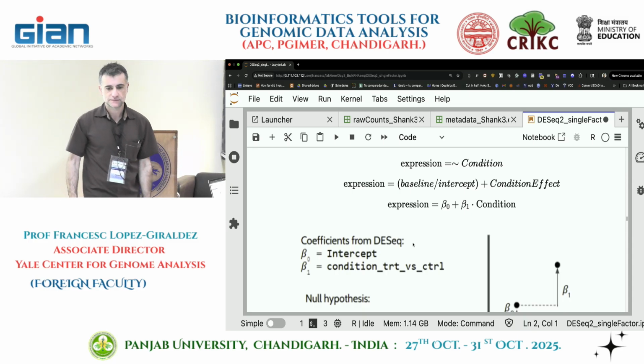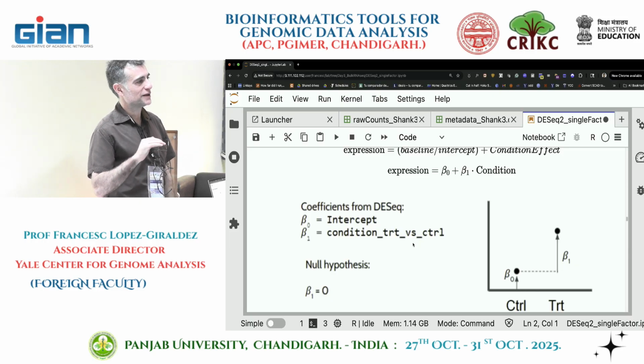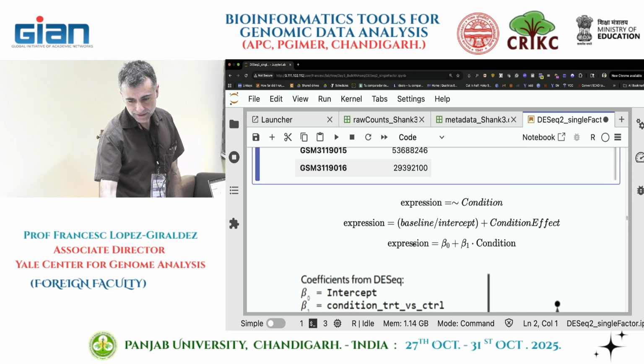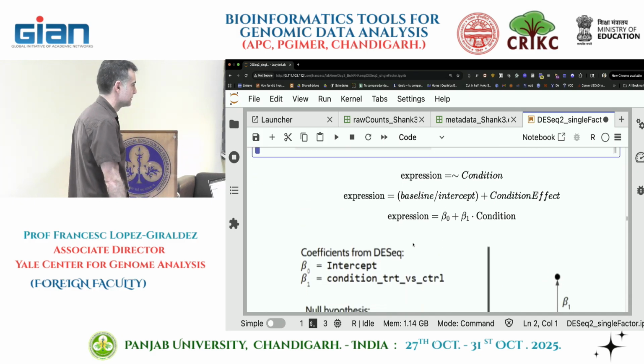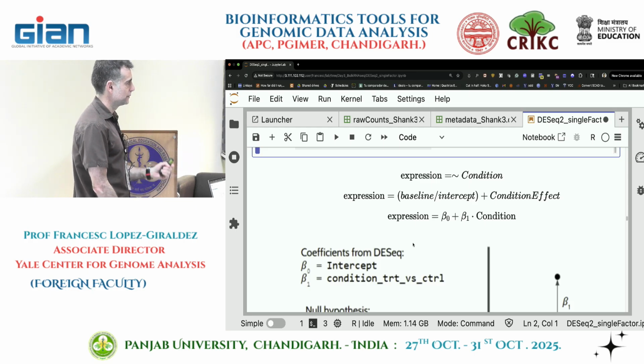It doesn't do anything else. Everything I'm saying is in the Jupyter notebook, so you can keep reading. colSums just returns the sum of every column. It gives you a value for every column. Every column in your count matrix is a sample.